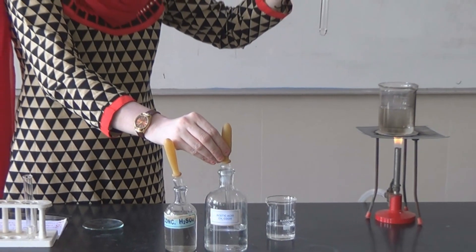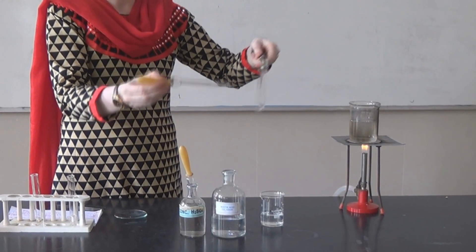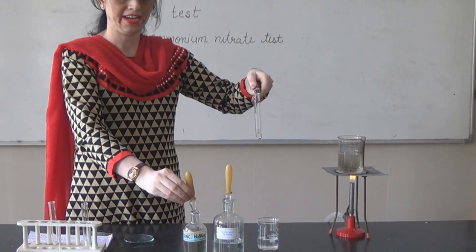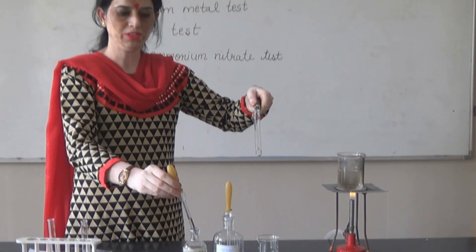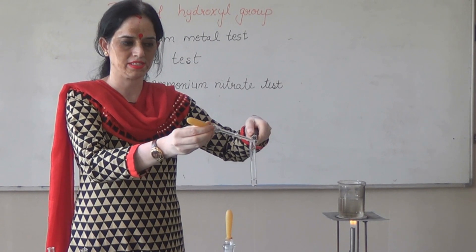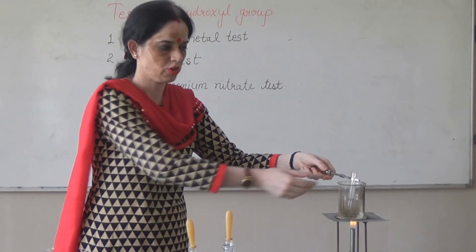Now add 2 ml acetic acid to it. After this, add 1-2 drops of concentrated sulfuric acid. Heat the content in a water bath.